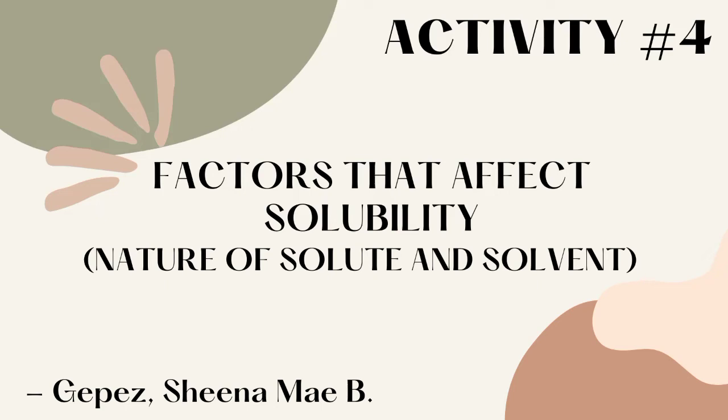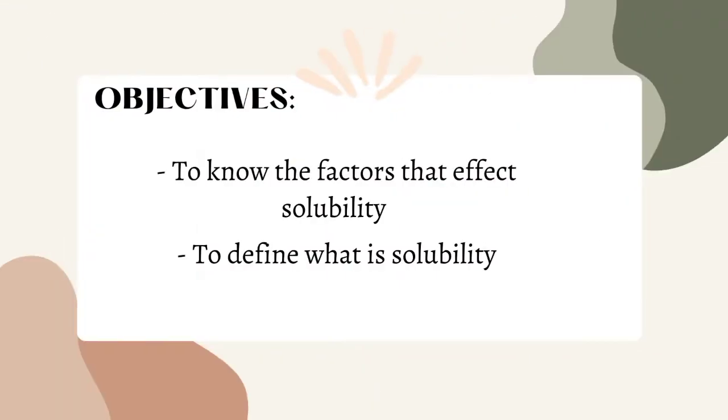Good day everyone, my name is Gepez and now I perform Activity 4 entitled Factors that Affect Solubility: Nature of Solute and Solvent. Objectives: to know the factors that affect solubility and to define what is solubility.